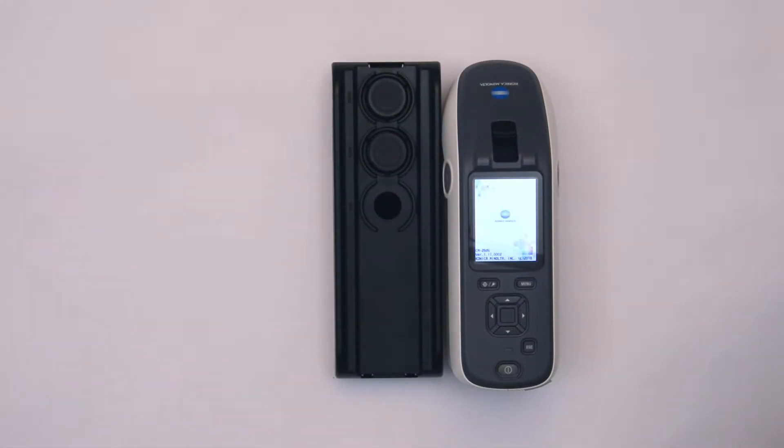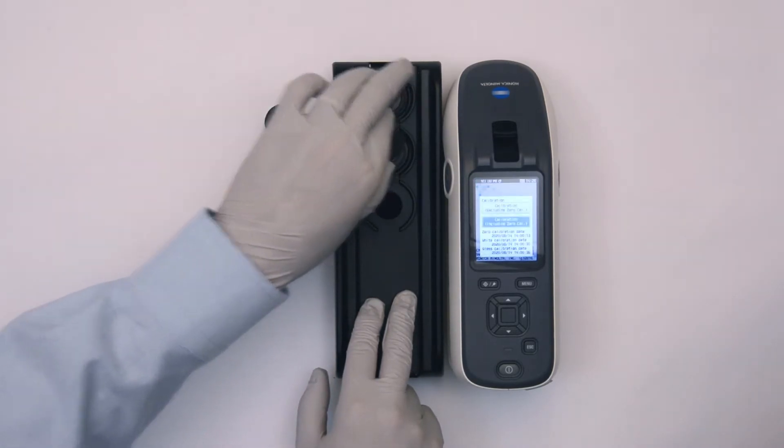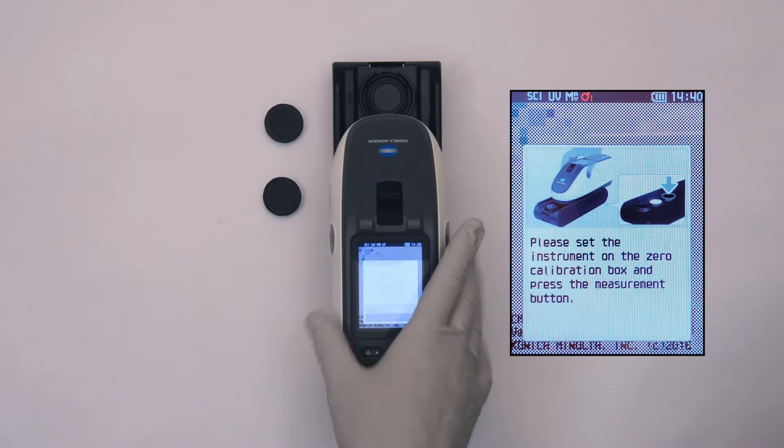Preparing the CM26DG for initial use is easy. Simply press the power button as seen here. You will need to calibrate the instrument before you can take any measurements. The calibration process is simple.